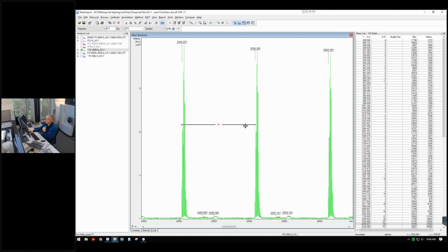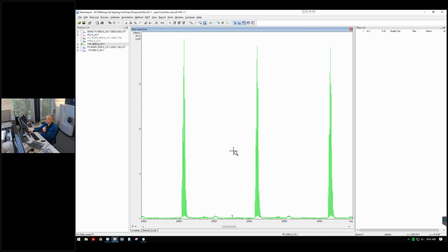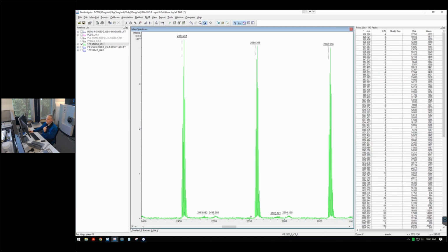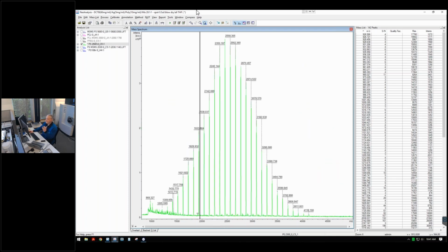And then if we do it again, it will label those peaks as polystyrene. And we can do this for every sample that we have. And again, to annotate peaks is very simple, find mass list. Now, once we get everything annotated and we're happy with that, we could go right into polytools.